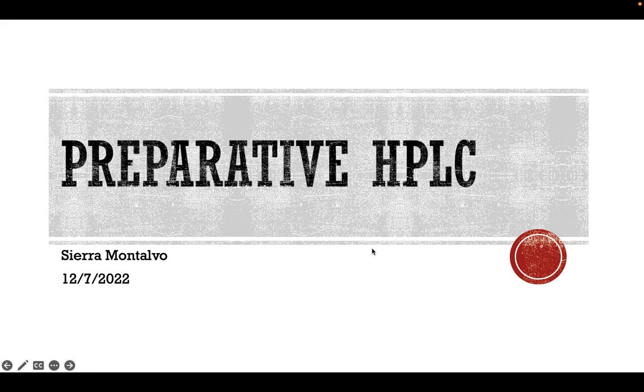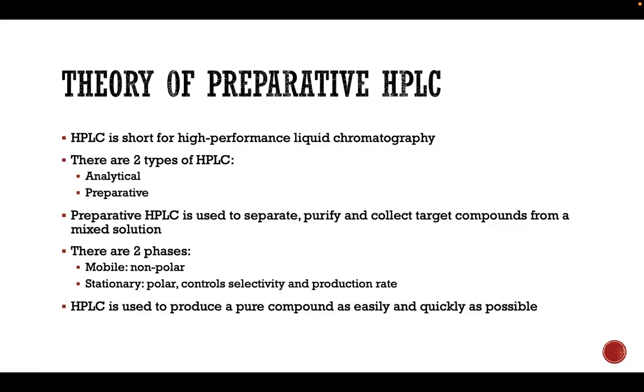Preparative HPLC. A little theory on that. HPLC is short for high performance liquid chromatography. There are two types of high performance liquid chromatography: analytical and preparative. Preparative HPLC is used to separate, purify, and collect target compounds from a mixed solution.